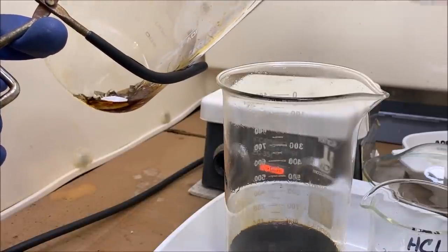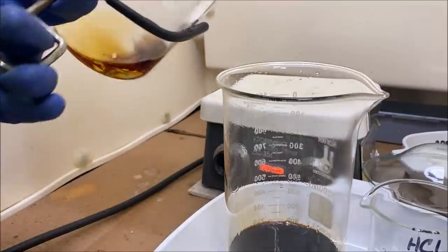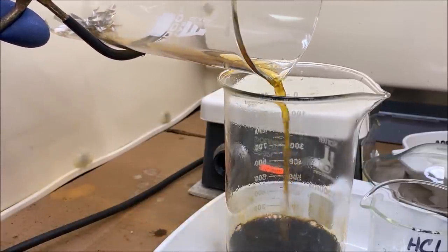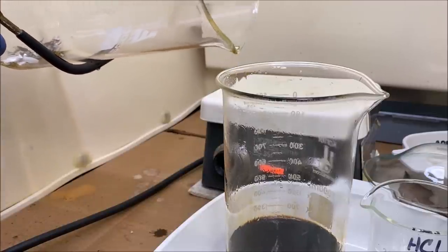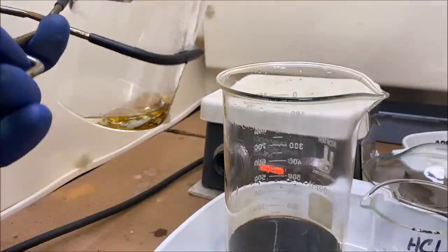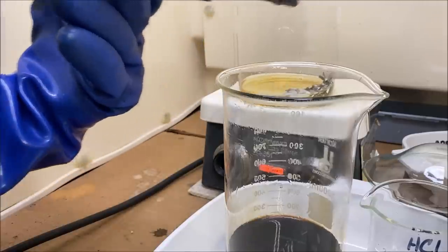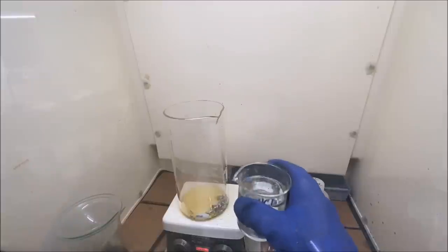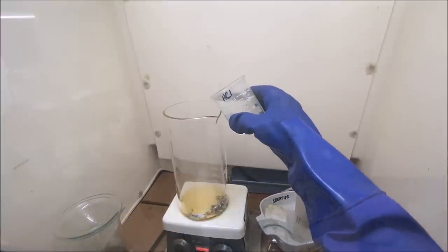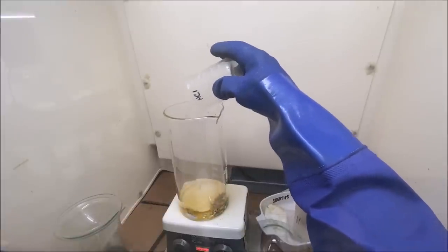What I should have is a cabinet that has gloves built into it so that I can just stick my hands into the gloves, like a sandblasting cabinet that has gloves built into the cabinet. And so I don't have to withdraw anything after it's been in contact with those fumes. You just have the fixed gloves, you stick your hands in the gloves, manipulate the solutions as you need to, and then when you pull your hands back out, they just come out of the gloves. So this is just too dangerous to try to attempt at the hobby level like I am working at.